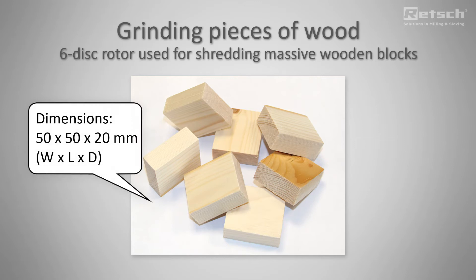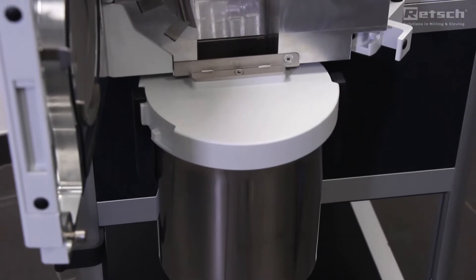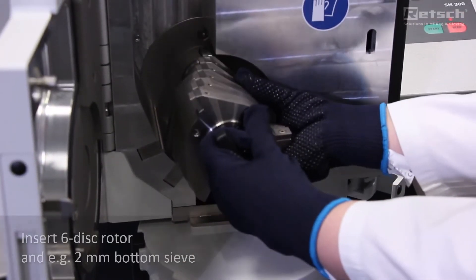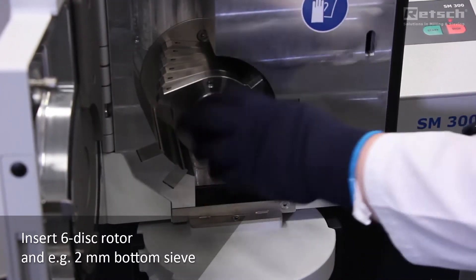For grinding massive samples like wooden blocks, we recommend to use a 6-disc rotor which is very robust. The pushfit rotors and bottom sieves don't require any tools for inserting them into the mill.